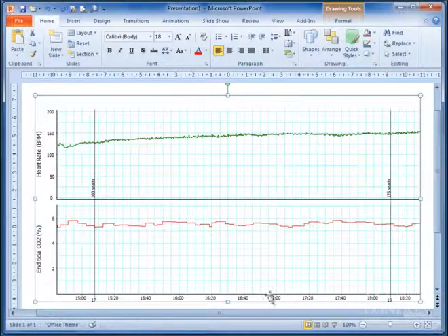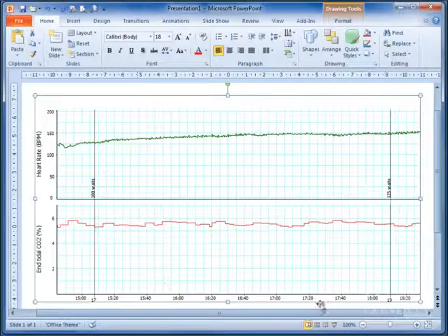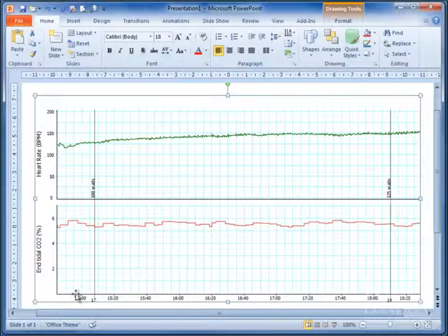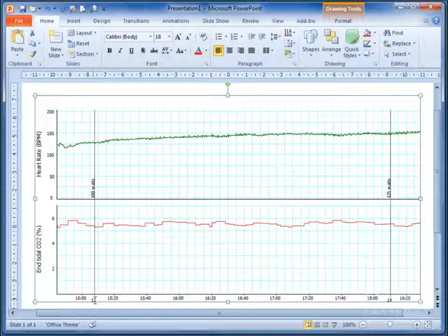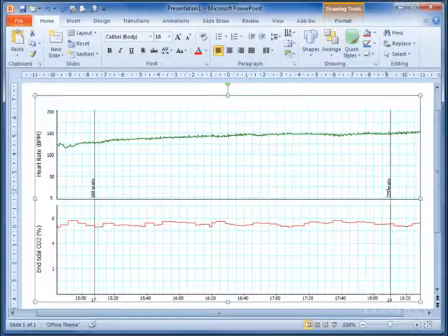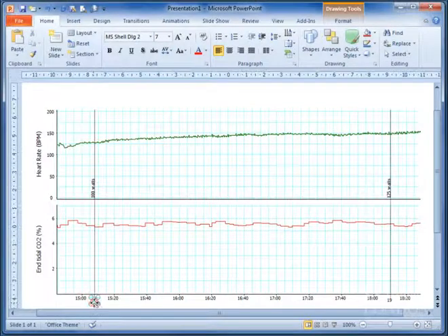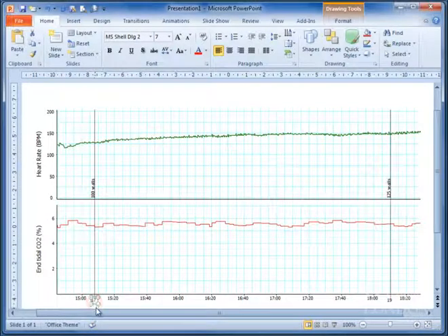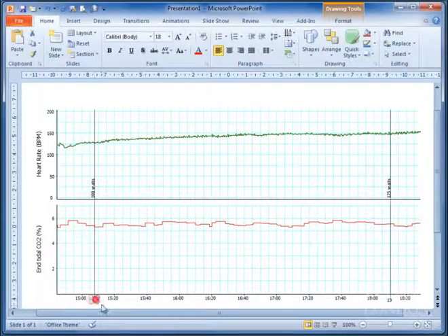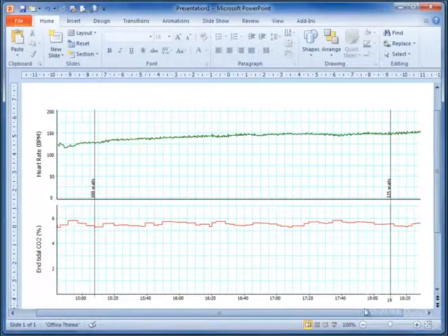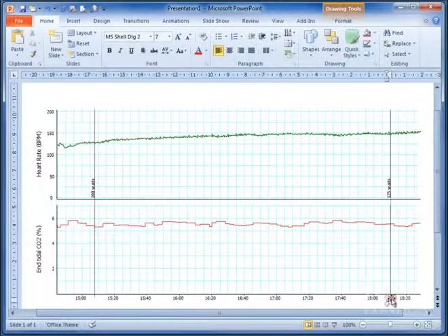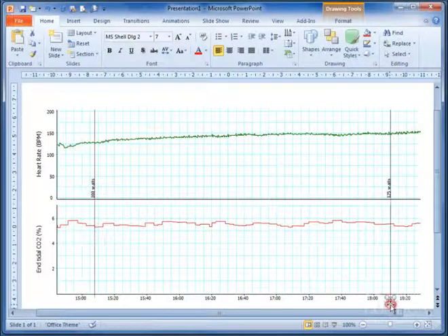What we'll do, though, is we want to align the scale here so that the time scale is in a fashion that we understand. If you try and present these data, it would say 15, 15, 20, 15, 40. That doesn't make much sense. So why not have 0 at 100, and then whatever 125 is. I suspect it'll be a 10 minute or 3 minute period. So what we're going to do is we're going to, first of all, delete this little number 17 that we don't need. We're going to delete the little number 19 that we don't need, and the little box that comes with it.